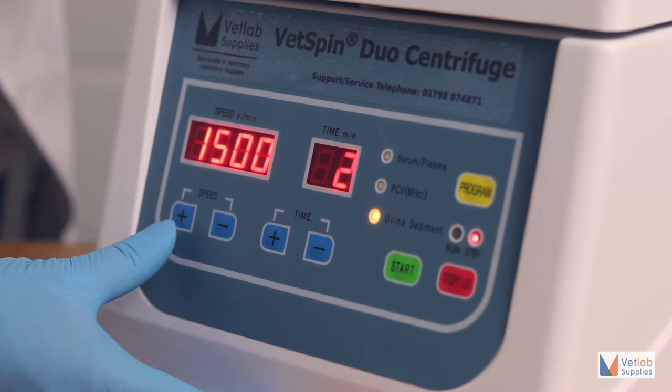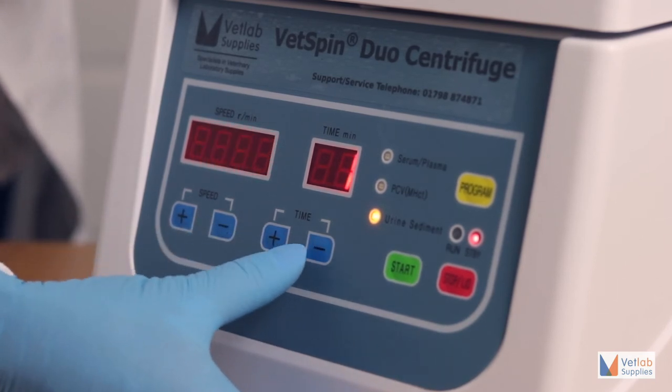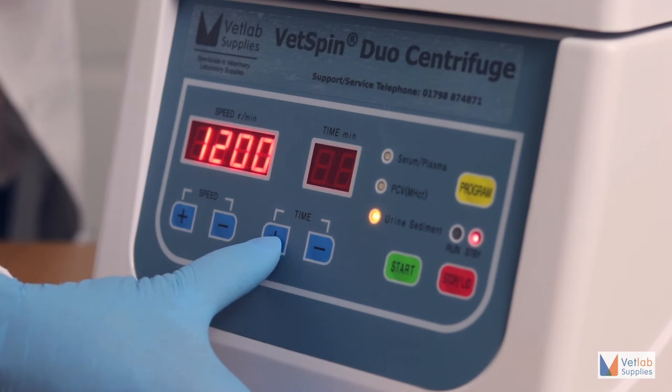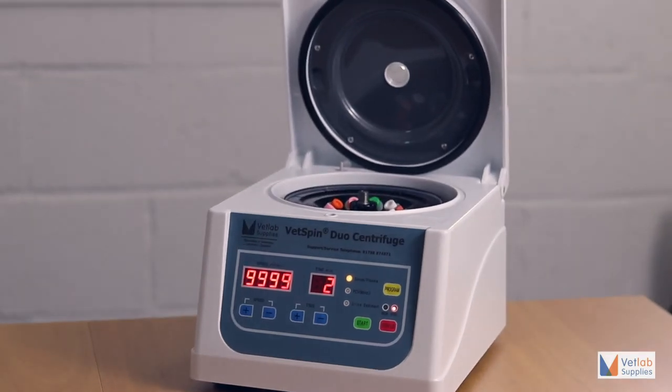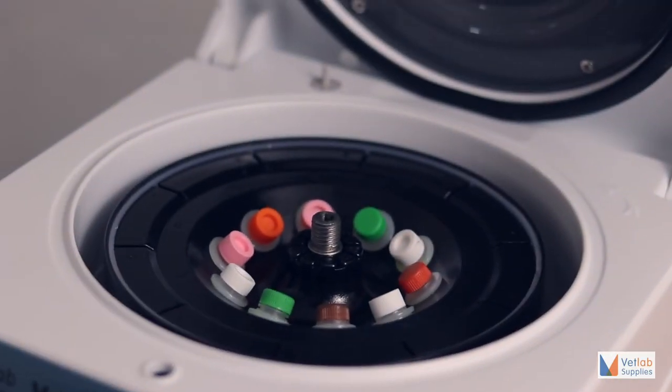Additionally, the programs can be altered for both speed and time in case a different setting is required for a special sample. Our centrifuge is not only very intuitive, but also simple and safe to operate.